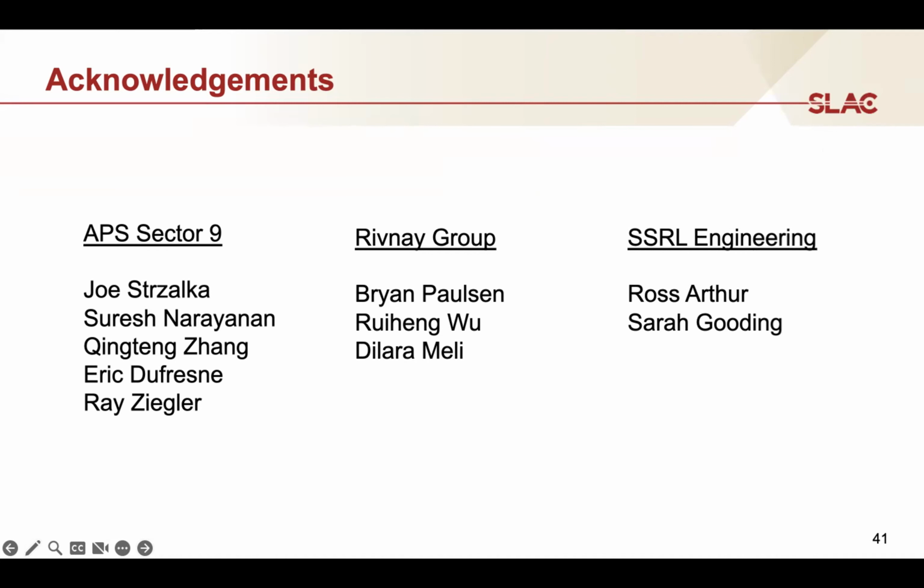Hi, this is Hua. I have a general question for the last part of the model. So you're thinking the dynamics for XPCS observation is some kind of polaron by polaron. They induce some strain effect in this polymer film, which can be picked up by XPCS. Is that right? Or do you need to do some conversion? Is the time scale you observe on XPCS really equivalent to the time scale for the real polaron propagation or their transformation, or is there some scale factor, or is it exactly the same time scale?